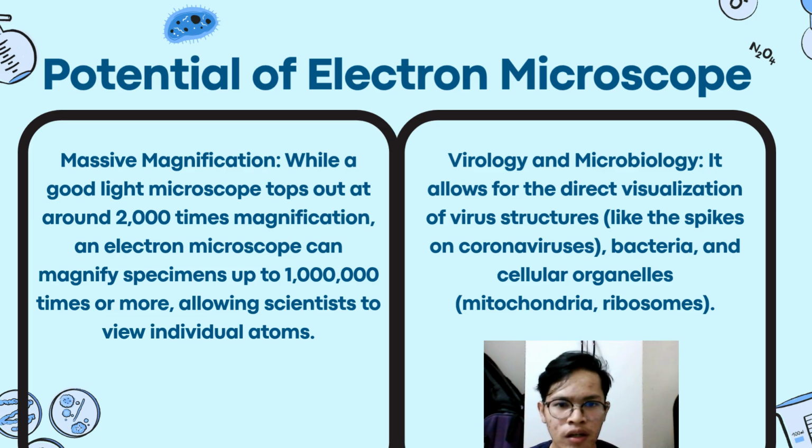Next is virology and microbiology. It allows for the direct visualization of virus structures like the spikes on coronavirus, bacteria, and cellular organelles. There are mitochondria and ribosomes.